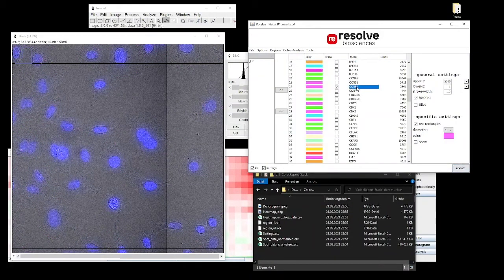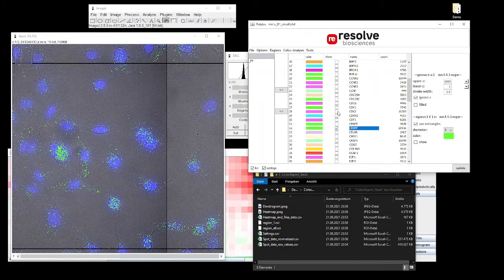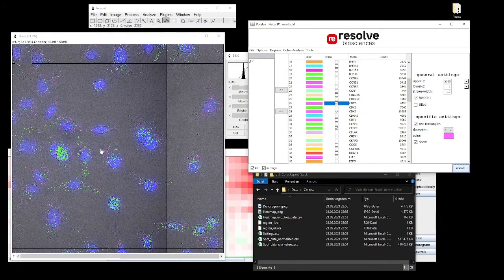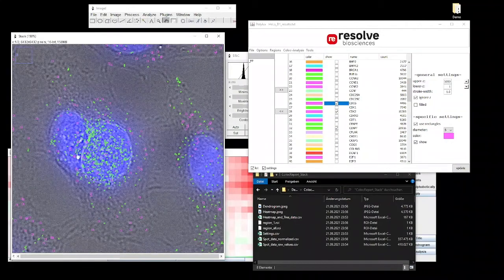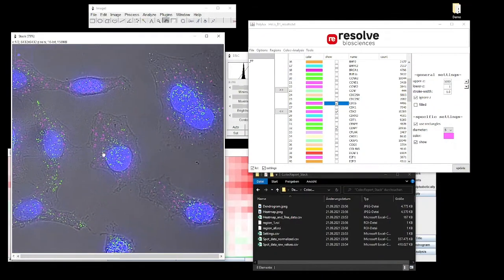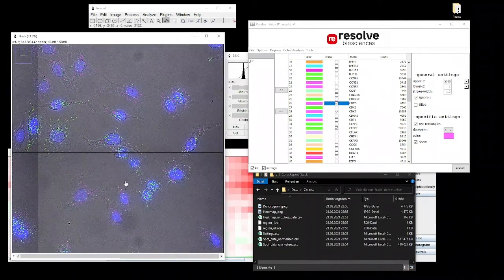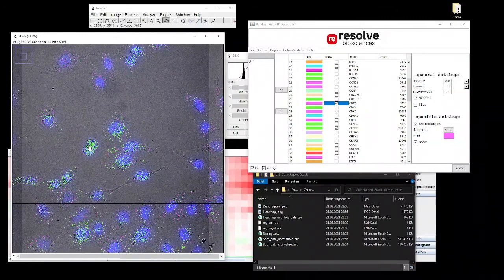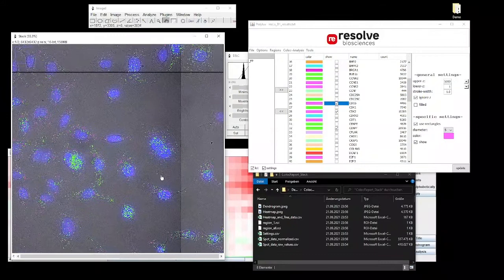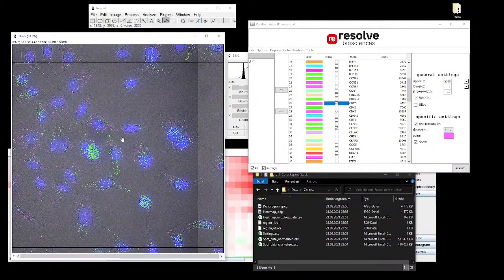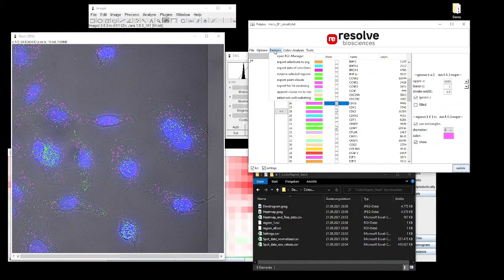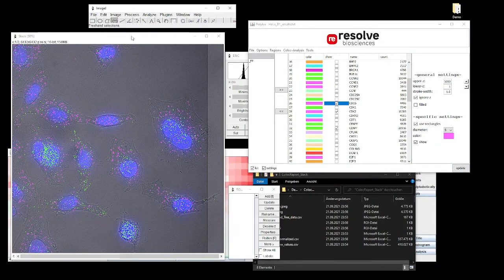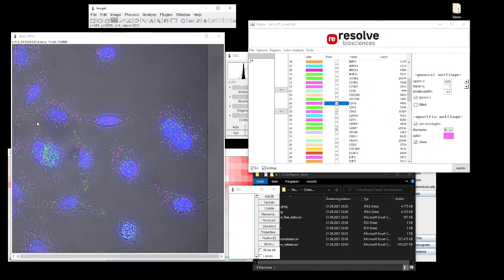It would be interesting to see what might be the reason for these two different clusterings of transcripts in different cells. One thing that is striking is that the green transcripts are predominantly found in cells that seem to be in cell division. It's very prominent in cells that are in cell division, and the purple transcripts are found in cells that are not dividing or have not just divided.